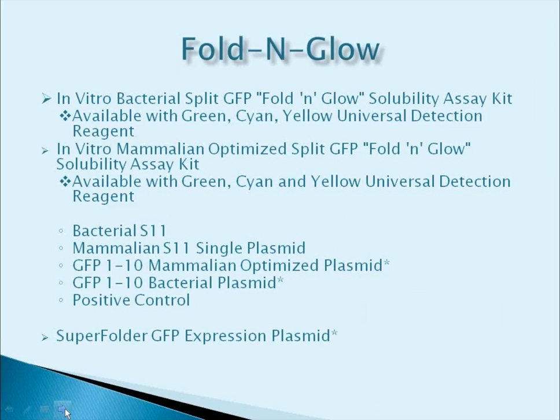These improvements allow for the quantitation of the expression level of a target protein, or determination of a target protein's solubility, or discovery of the domains of a protein that are soluble, and for studying protein-protein interactions, and also to reveal the effect of specific molecules on protein folding.